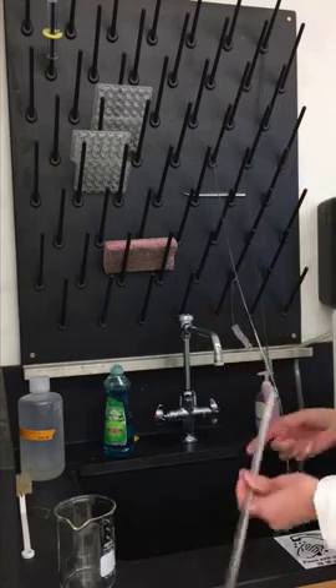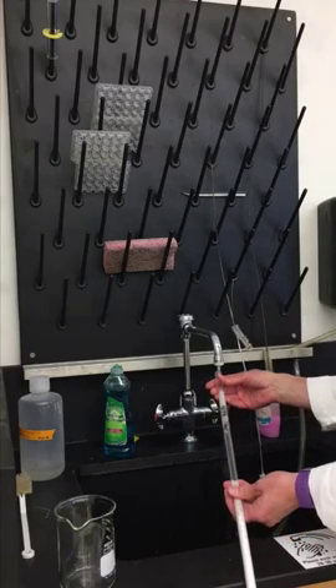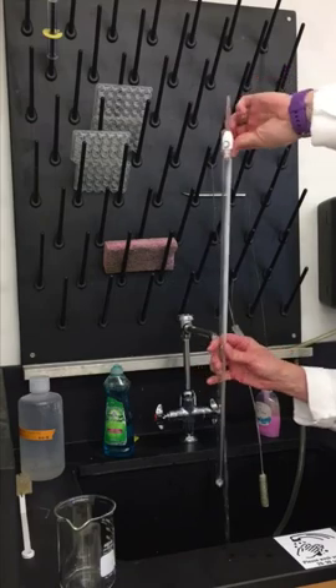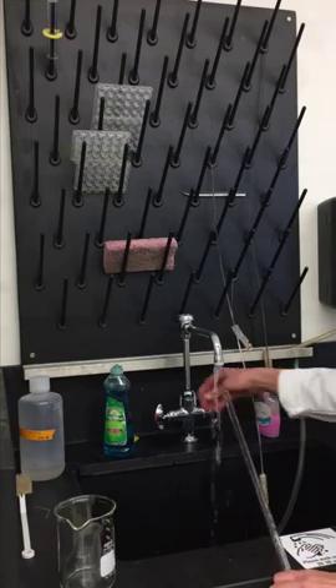Make sure you close the stopcock and then rinse with tap water — you want to rinse all that soap out. Fill it up, turn it upside down, and open up the stopcock. Do this several times until you get all the soap out of your burette.